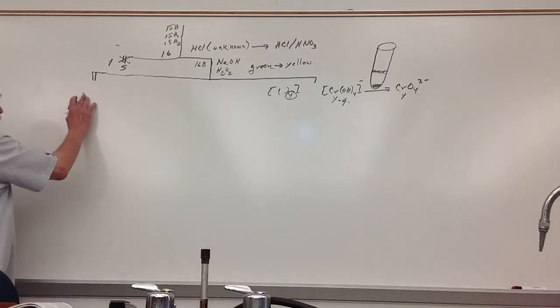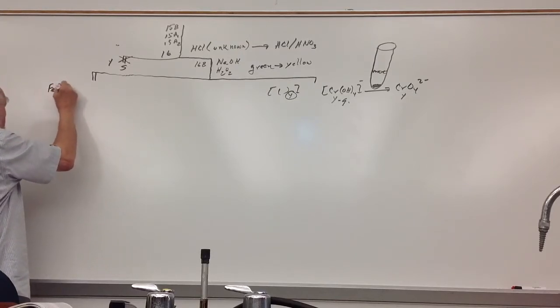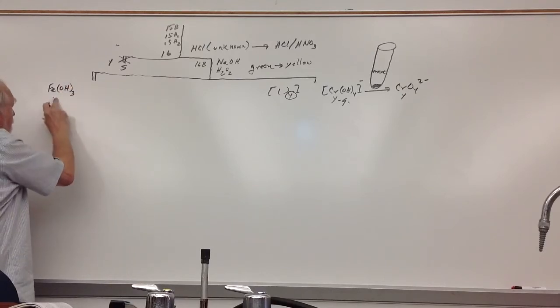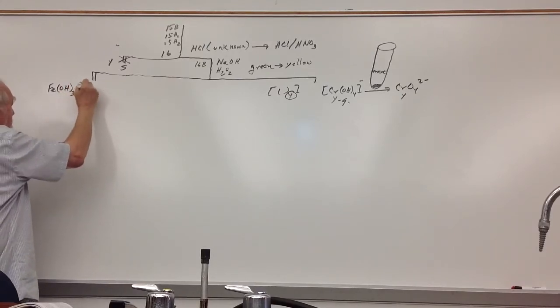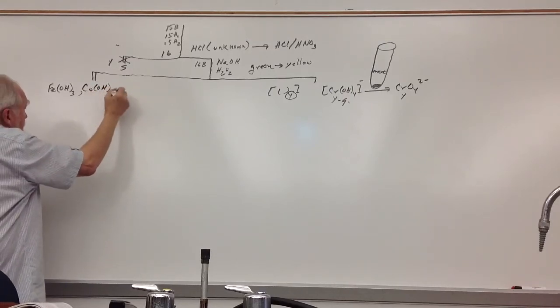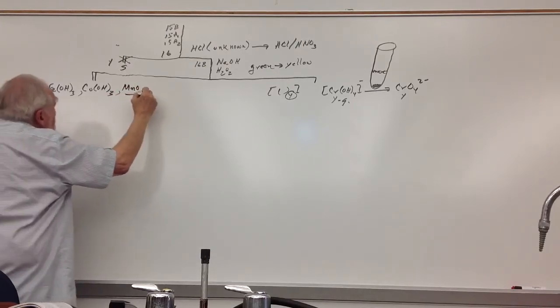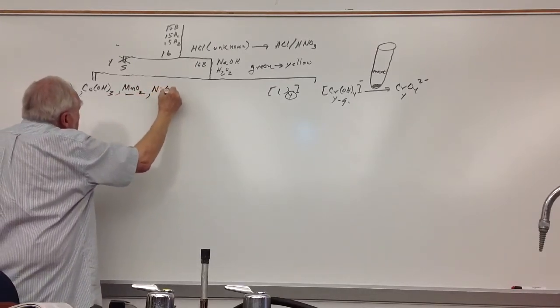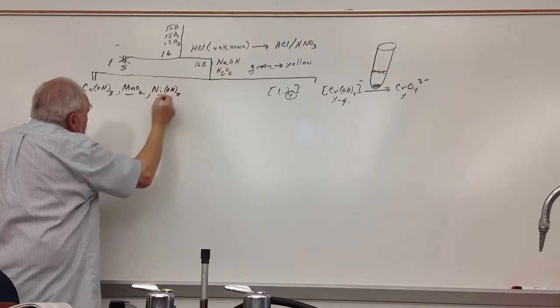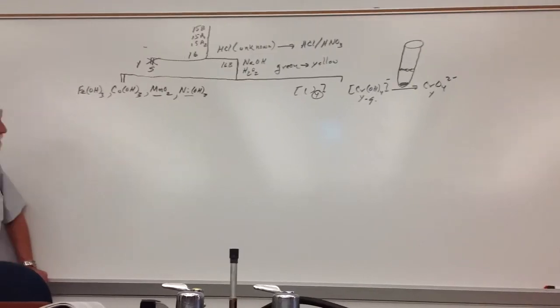Coming back to this thing, you have your precipitates. I'll write the higher oxidation states. This is what gave you the black. Oh, the one thing I forgot back there in 16A, it says 30 seconds, and that's it. I already mentioned this.